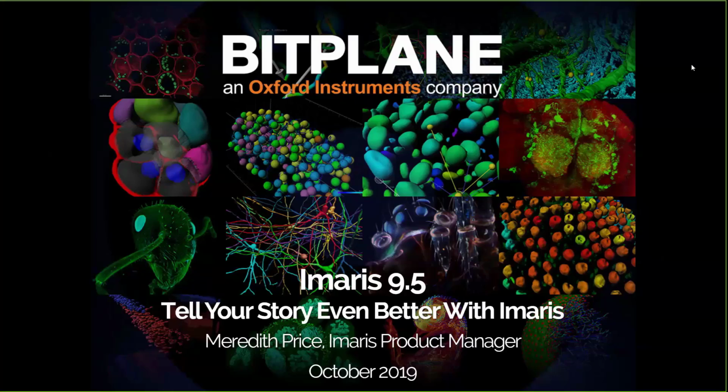This is for Imaris 9.5, and the theme of this release is to tell your story even better with Imaris. And so really the entire team here at Imaris, that goes for the sales and support people that you interact with, as well as the development teams in Zurich and Belfast and the marketing teams as well. We're so excited for this release. We think that there's great features within this release that will mean a lot to you and in your daily work. And so we're excited to show it off to you, and we're excited to finally be able to get it into your hands after we've been able to play with it for a little while now.